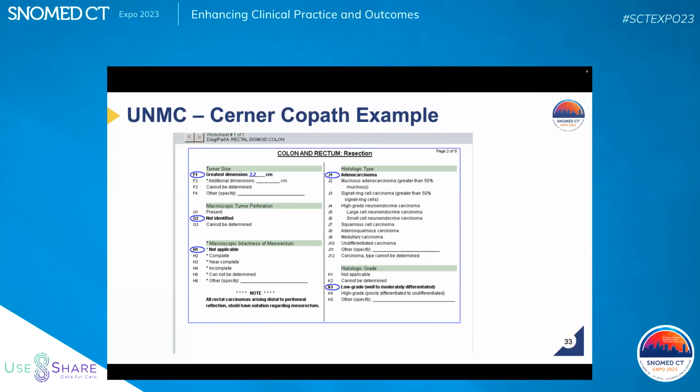So at any rate, the physician just interacts with this, and it creates the written report, and in our institution, we transmit this data in HL7 version 2 back to our biorepository. OBX, for those in the States, OBX3 is a SNOMED question, and OBX5 is the answer, unless it's a numerical answer, and then it's in a different field.